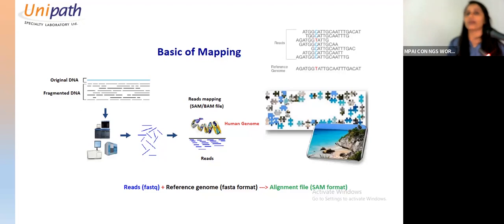When you analyze, after that you get to know about the variant allele frequency. If half of the reads represent T and half of them represent C, then it is a heterozygous mutation. If all the reads, here it is just 10 reads, otherwise you can consider 100 reads, if all 100 reads represent C here and in the reference it is T, that means it is a homozygous mutation, right?